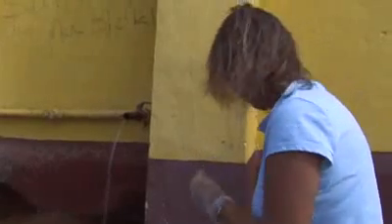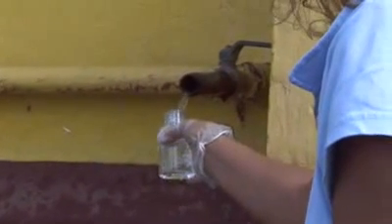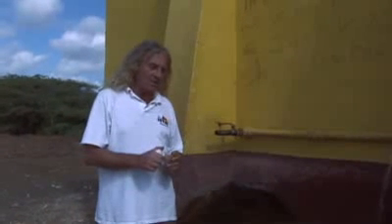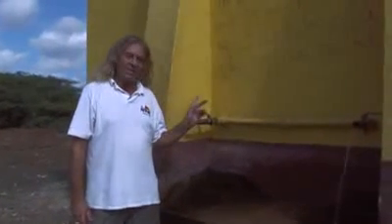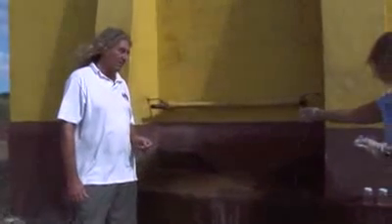We're going to take 3 samples today. We only took 1 yesterday. Right. And the reason we're taking 3 is to be absolutely sure of the evidence that we've found. Now, the tests that we're doing are an accepted test by the EPA and in some circumstances have closed beaches. And certainly, if the second set of tests that we do come back positive, it will mean that this well, probably along with many others, will have to be closed.